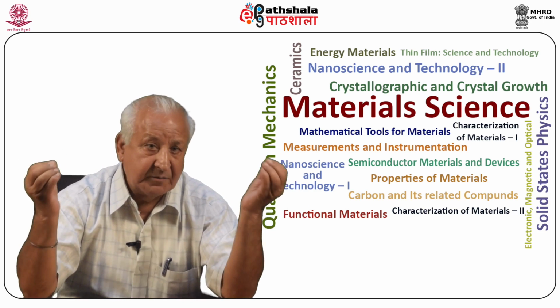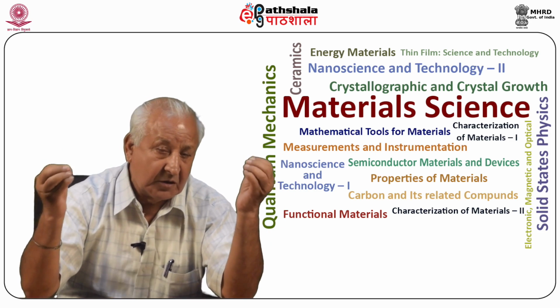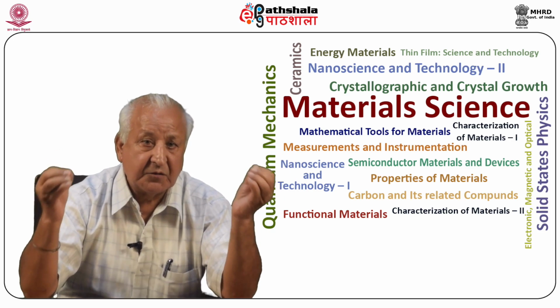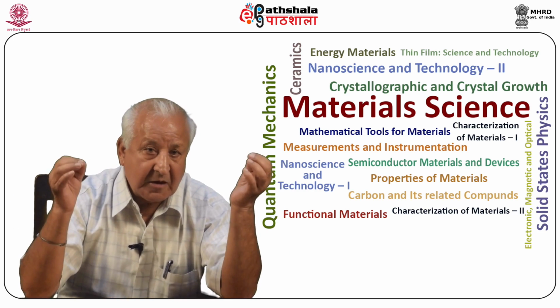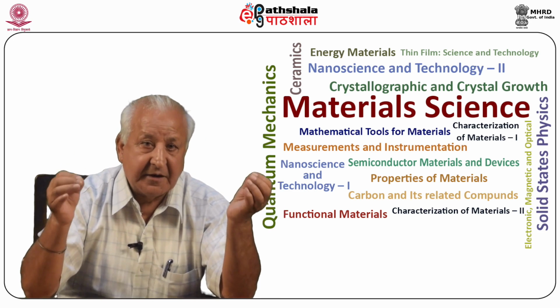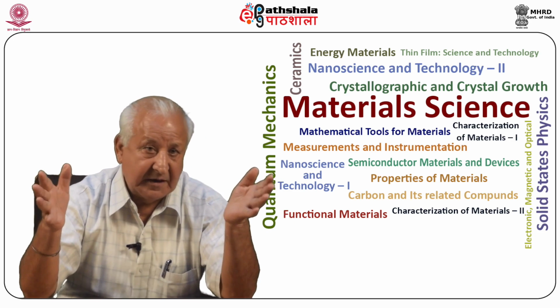Crystallization process in gel medium. Based on the nature of the chemical reactions and physical changes involved during the growth processes, gel medium growth may be classified into 4 groups: growth by chemical reaction, growth by chemical reduction, growth by complex dilution method, growth by solubility reduction method. Let us briefly describe each one of them.